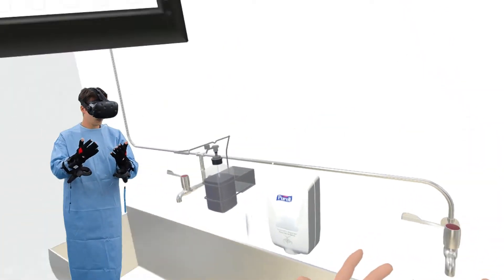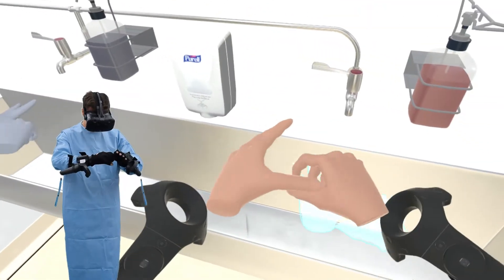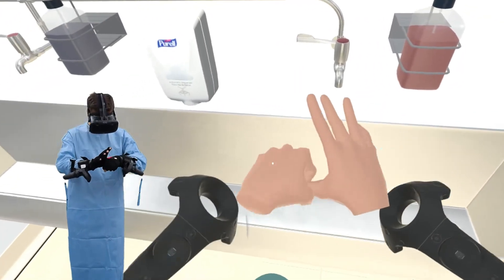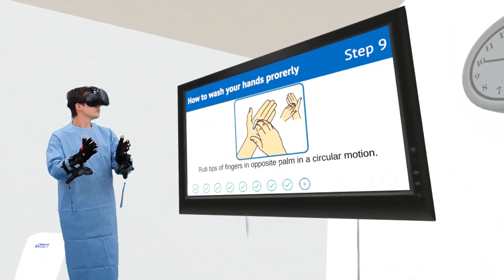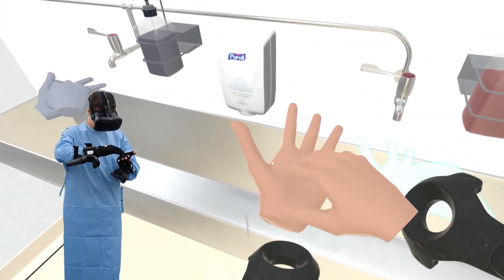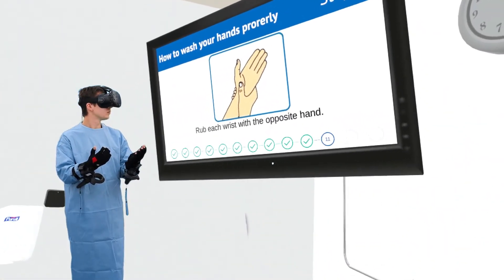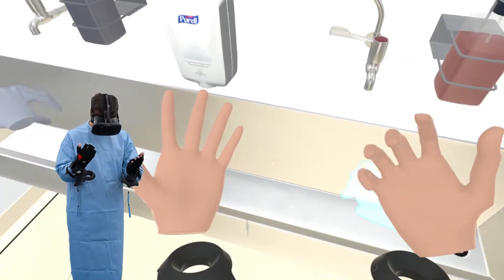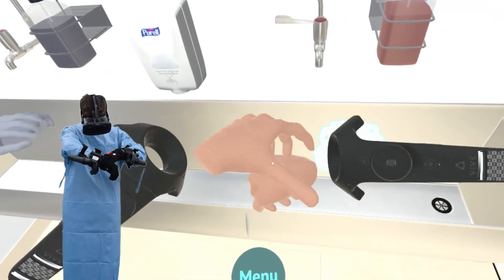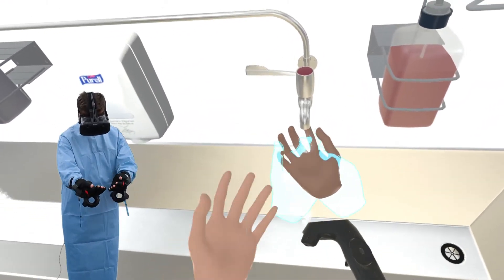Rub each thumb clasped in opposite hand using a rotational movement. Rub tips of fingers in opposite palm in a circular motion. Rinse hands with water.